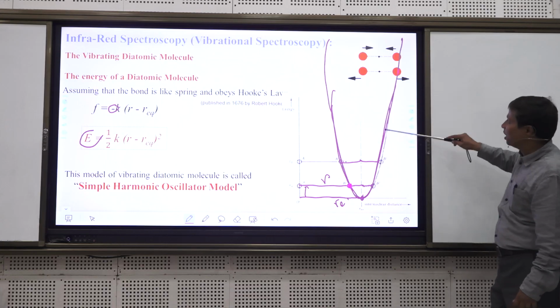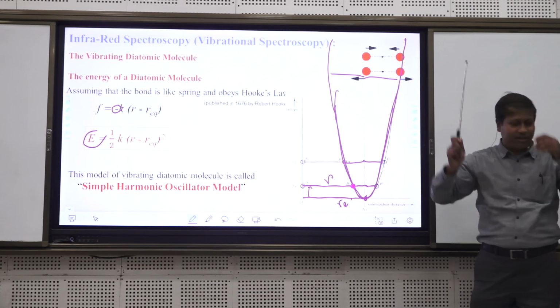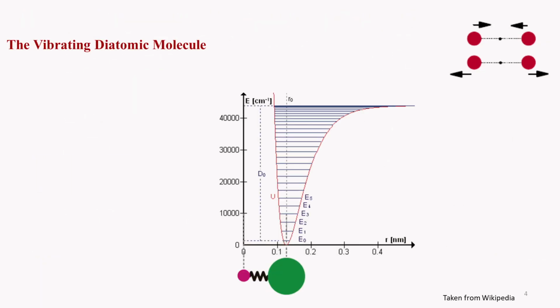So this means you stretch more, compress more, nothing happens, just increasing. This is taken from internet. If somebody still has a problem, then you can think of it this way. You see this atom is vibrating between these two points.